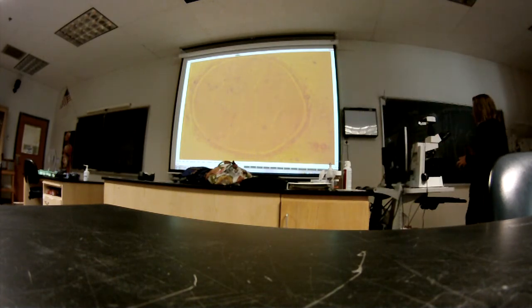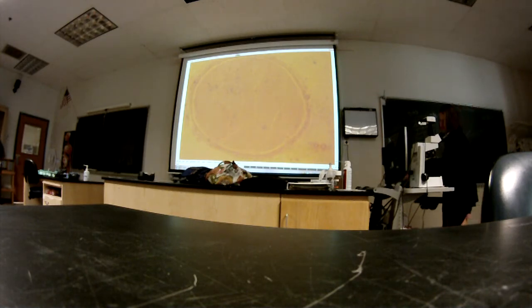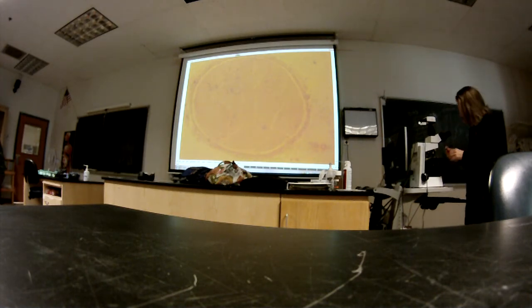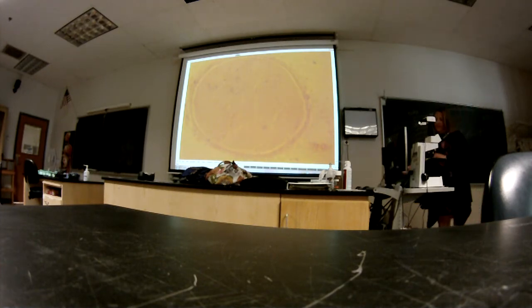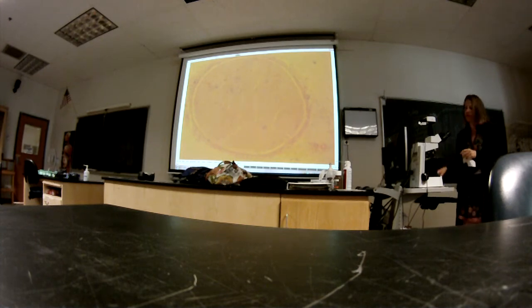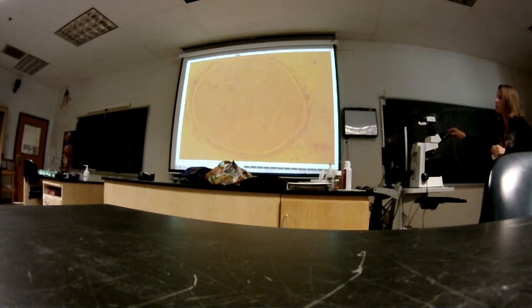Okay, what is this circular structure? A nerve. A nerve, good. Sometimes it's hard to see the big picture in anatomy, huh? We get caught up in the little details and forget the big picture. This is an organ, it's a nerve. It's made up of various tissues.